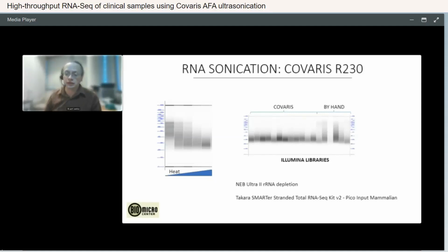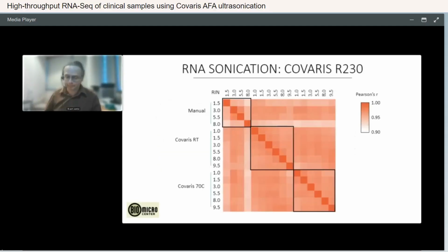And so the data I'm going to show you today is using 1 nanogram of input using the Takara ZAP-R kit. So this is the data that comes out. Here's just a raw correlation analysis. I will note the scale. This is a technical replicate. All of these should be completely identical.